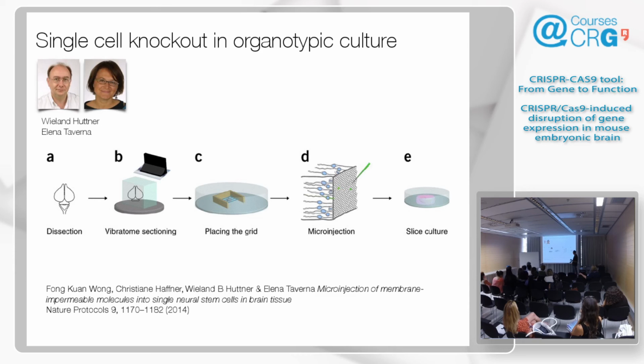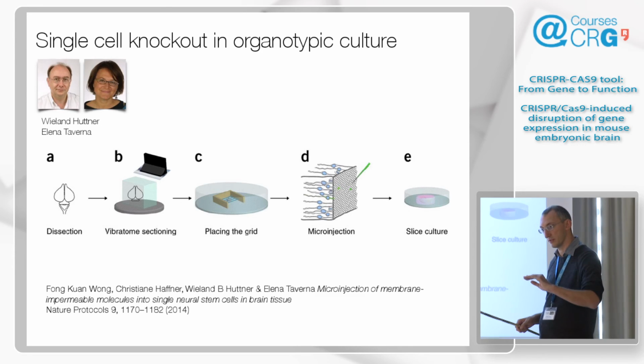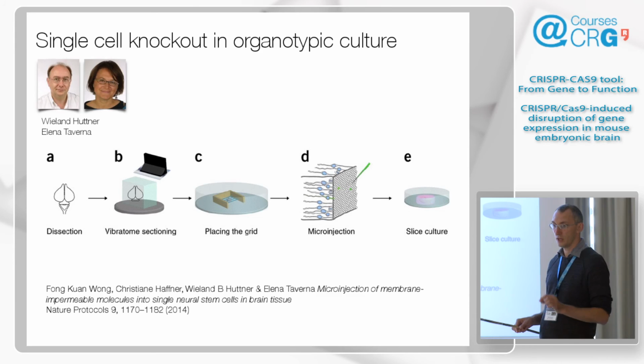On that type of culture, you could also microinject. You take your needle, and without seeing anything, you aim at the surface of the layer where the nuclei are. There's no staining, there's nothing, so as not to perturb it, and you inject.